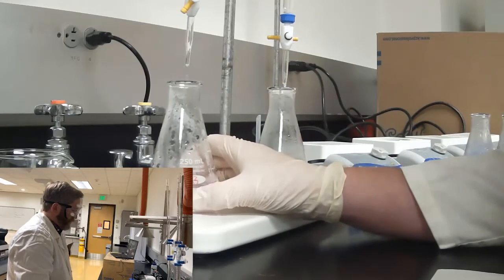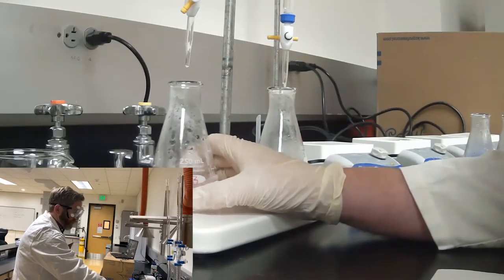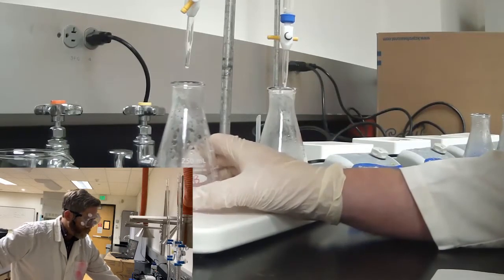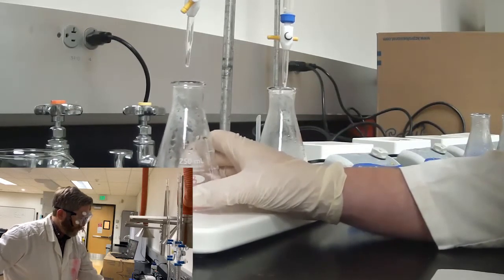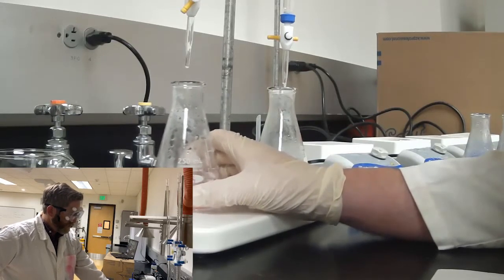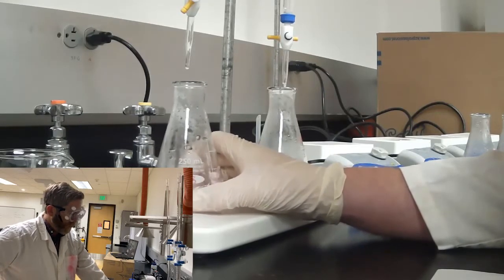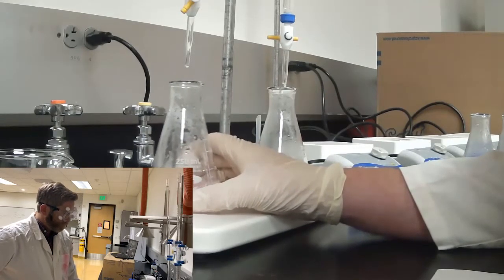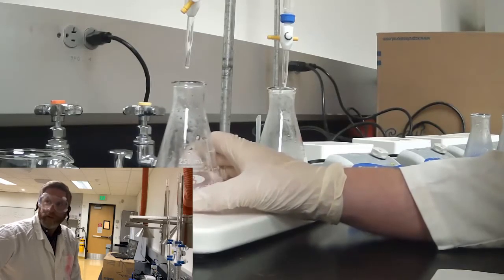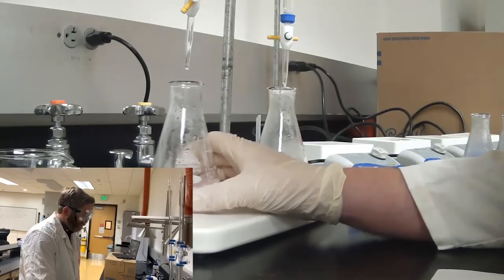Okay, the way titration works is we carefully add our titrant, which is our 0.1 molar sodium hydroxide, to the Erlenmeyer flask with a swirling motion until we reach the end point, at which point we will see a color change from whatever this is to the yellow, indicating that all of the acid has been neutralized. We need to begin our titrations now.